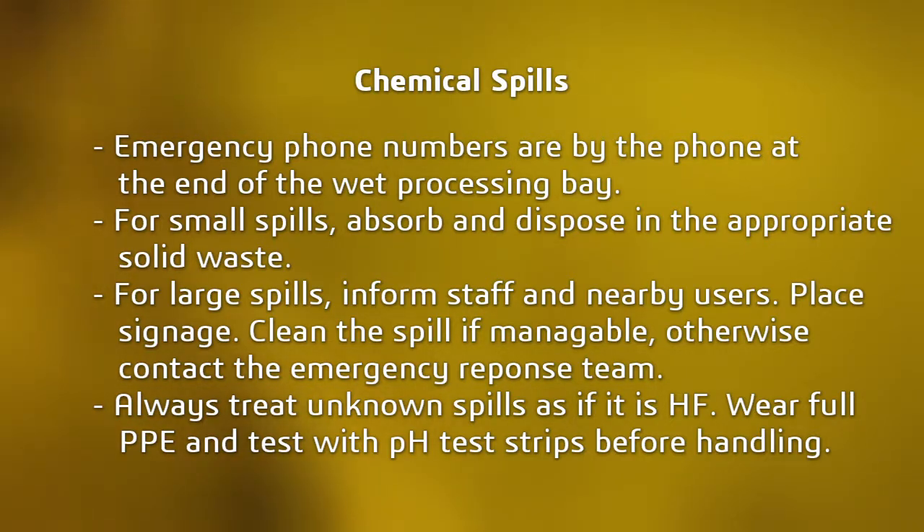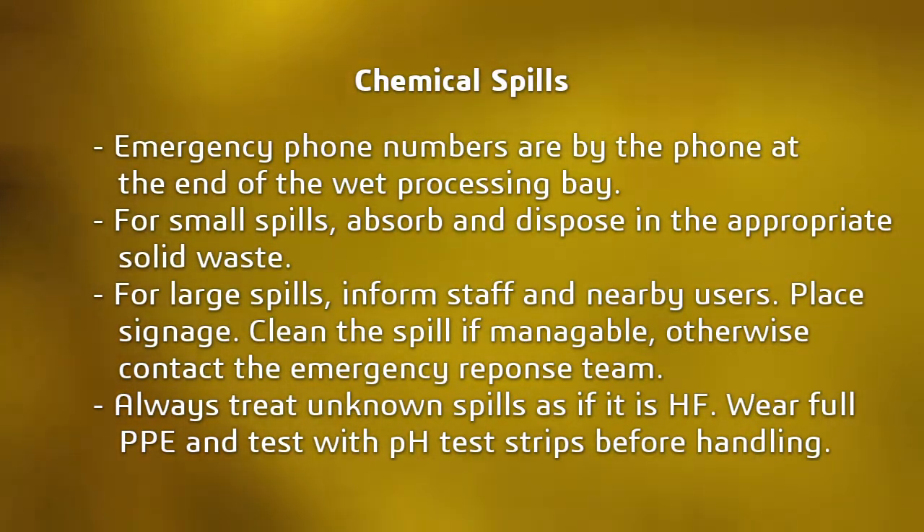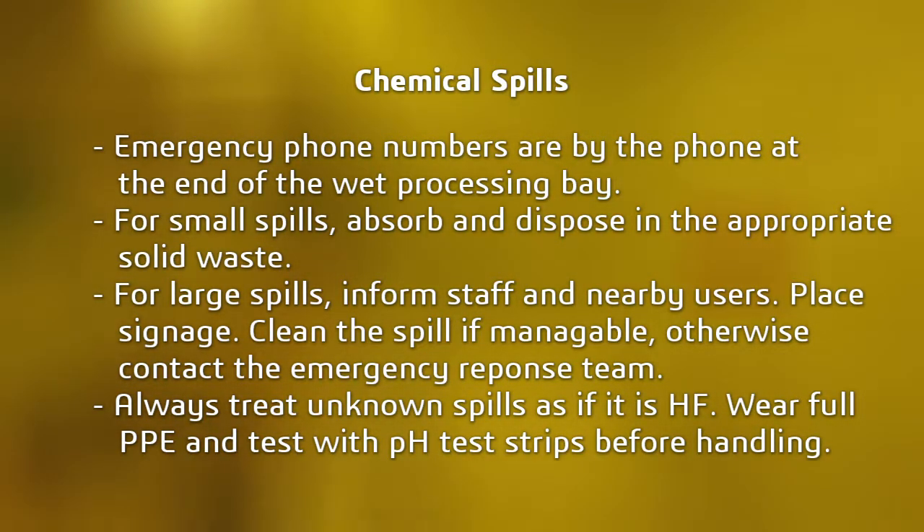First, inform staff and nearby users and place spill signage. Remember to wear full PPE when cleaning a spill. Use the acid or base neutralizer spray to neutralize the spill and absorbent pads to clean the spill. Double bag and tag any waste generated from the spill. If you feel you are unable to handle cleanup, isolate the area with signage and notify staff. Ensure other users are aware of the spill.